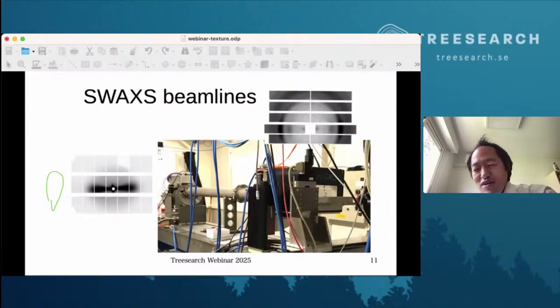Of course, you can also have a lot more sophisticated, more expensive X-ray setups, like at MAX IV in Lund, or at ESRF in Grenoble. There is one in Hamburg. In many countries, you have synchrotrons, and you can do similar types of experiments with a much brighter beam or with more sophisticated detecting systems. But essentially, you can already do a lot of things with the simplest setup.